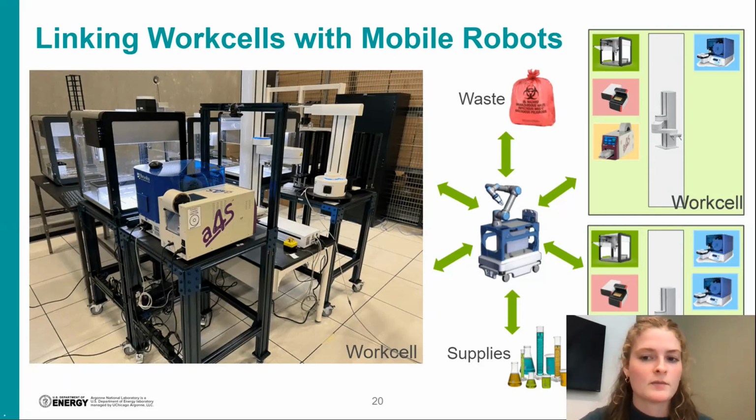So we're experimenting with mobile robotics. Another thing is that the runtime on a work cell right now is limited by the number of supplies that we can stack and are accessible by that robotic arm. But how would we think about bringing in more supplies to the system and taking out the used supplies when it's done? And for that, again, we're using mobile robotics, but we have a robotic arm attached to a mobile base that will roam around and dock itself to the modules and bring supplies in and out.